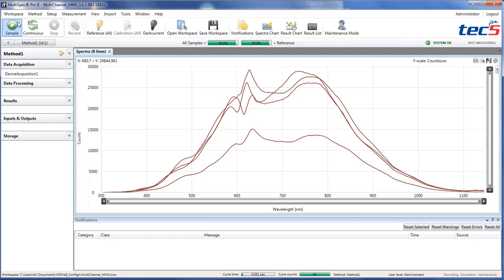Now you are prepared to configure your Multispec Pro 2 workspace by adding data processing, results, input and output steps, or storage steps.